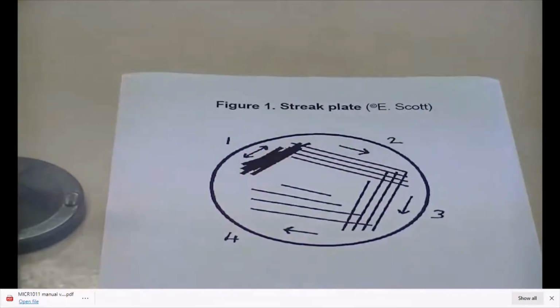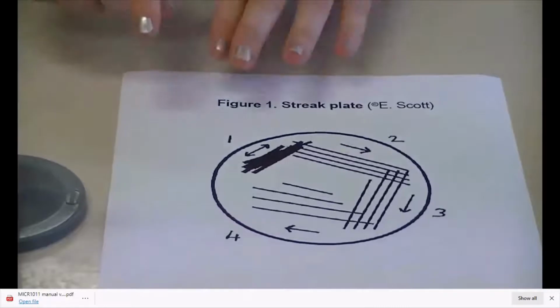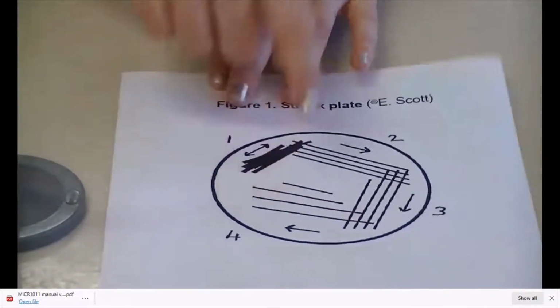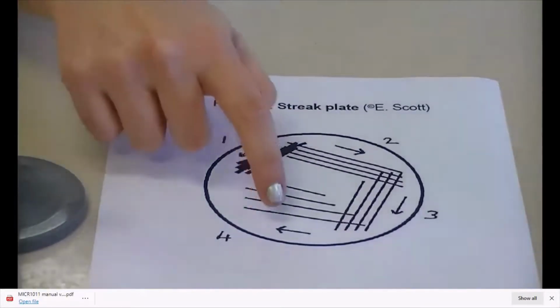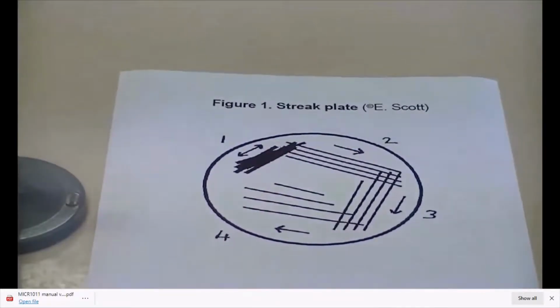One viable cell from a bacteria or yeast usually gives rise to one colony. So in this diagram, you can see in the quaternary steps that there are streak lines which don't intersect with the tertiary lines. That is one way of performing the streak plate technique. With your quaternary lines, you could also perform a vertical line and a squiggle in the middle of the plate. There are a number of ways that you can do this, and both ways are acceptable.